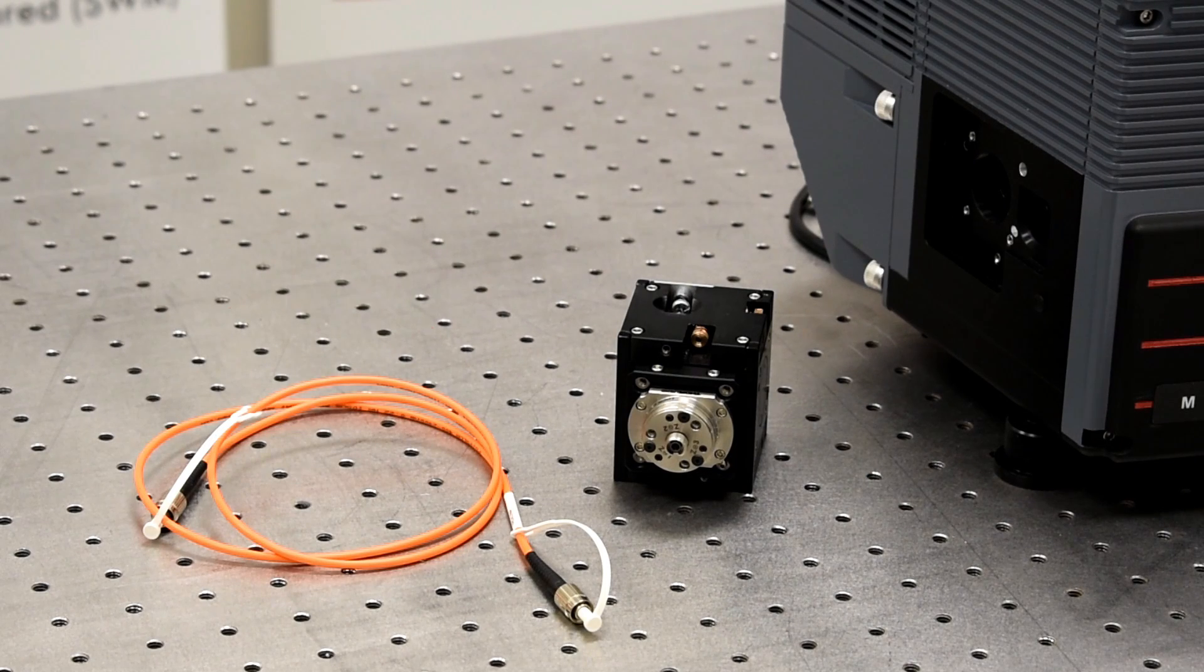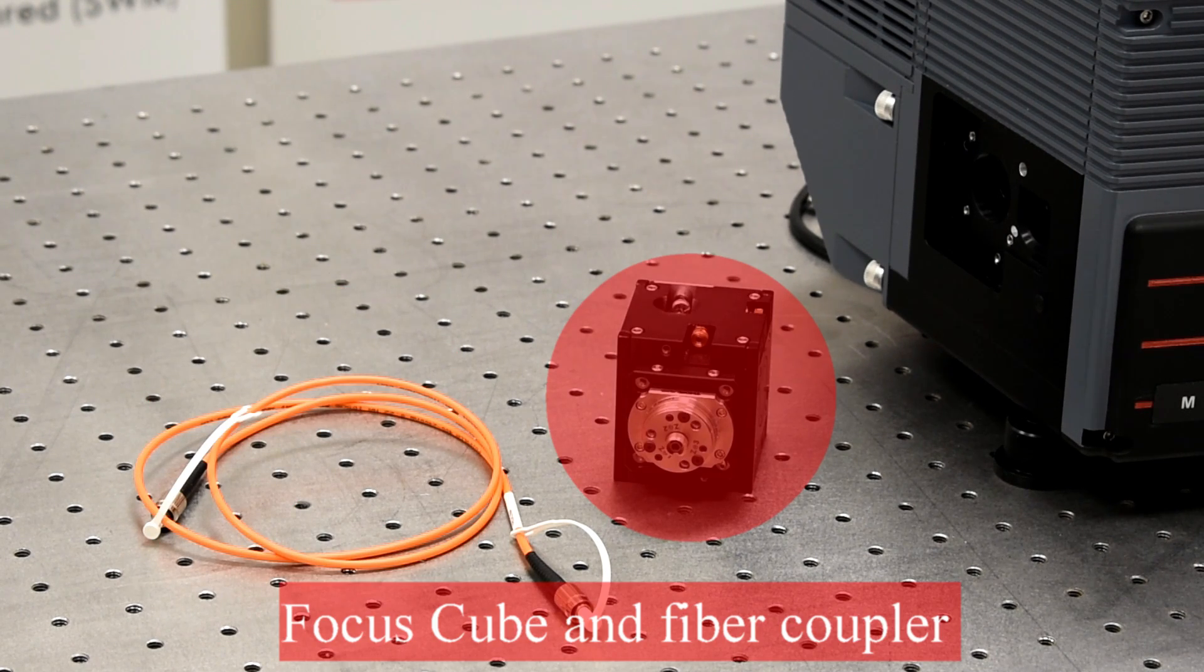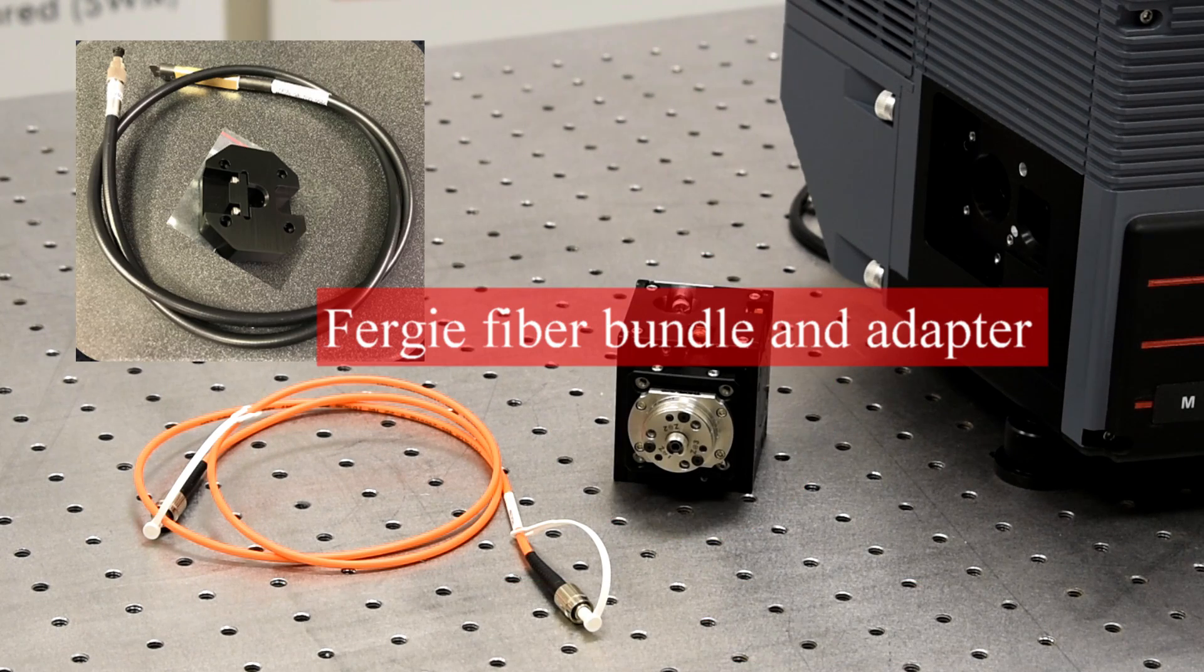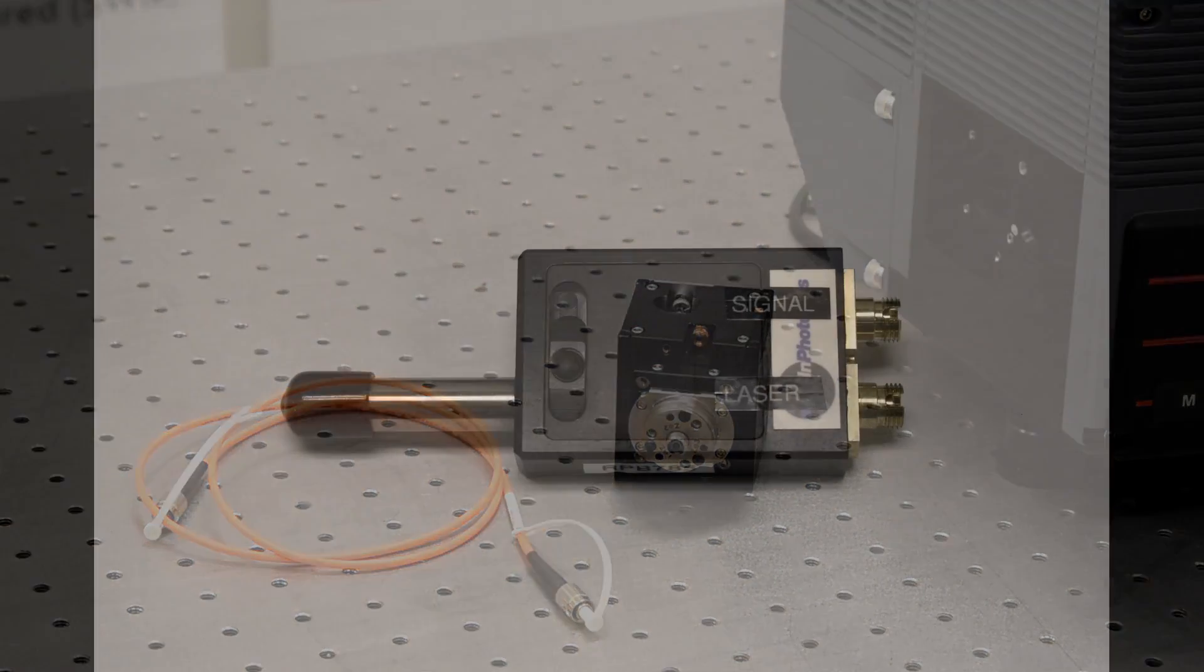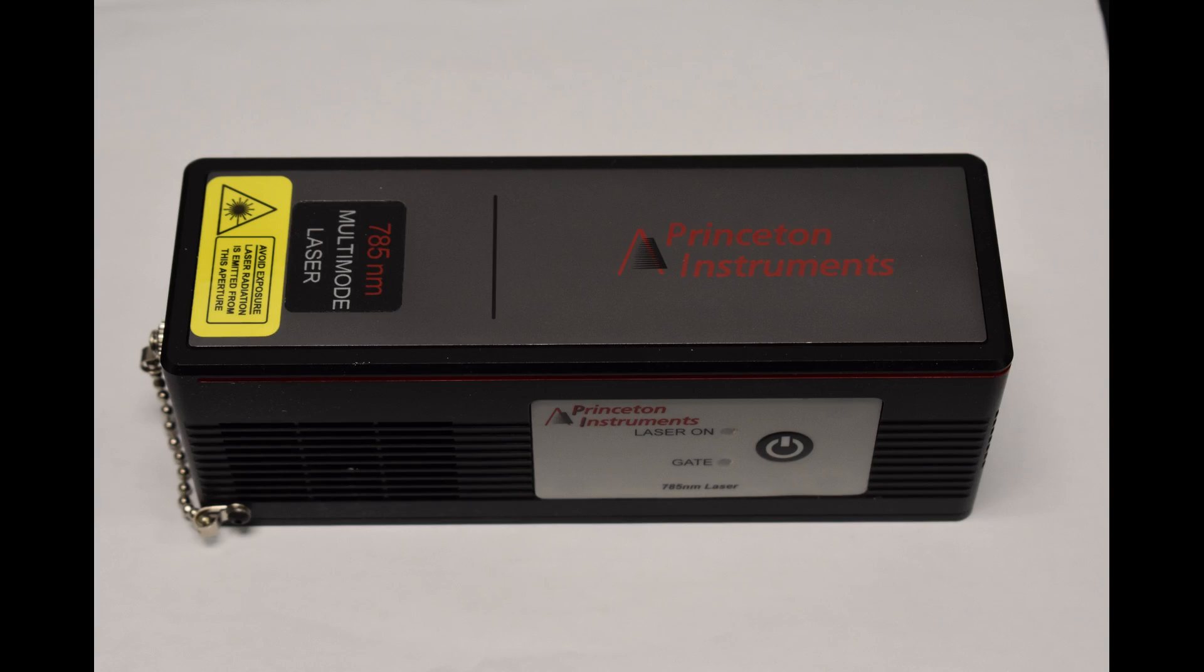We will use FC fiber cables for laser excitation and signal collection, a Fergie focus cube with attached fiber port, a Fergie fiber bundle and fiber bundle adapter, a fiber-connected Raman probe, and a 785 nanometer excitation laser.